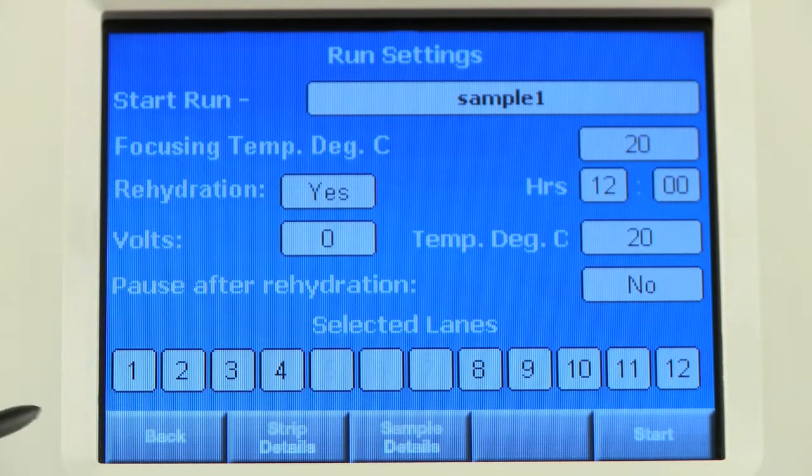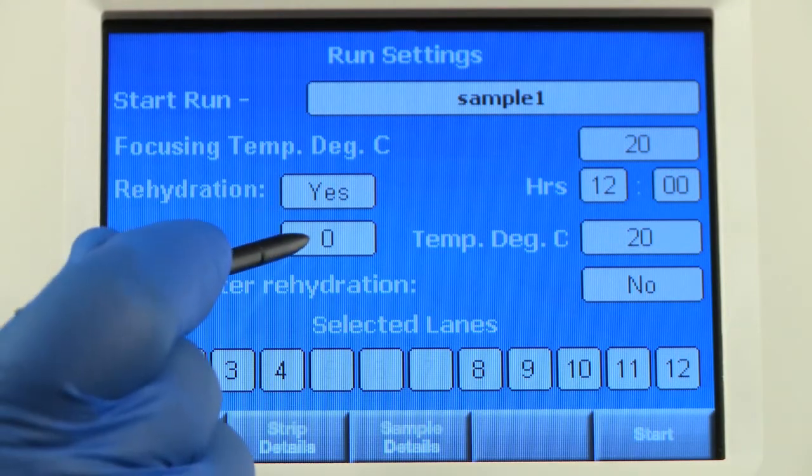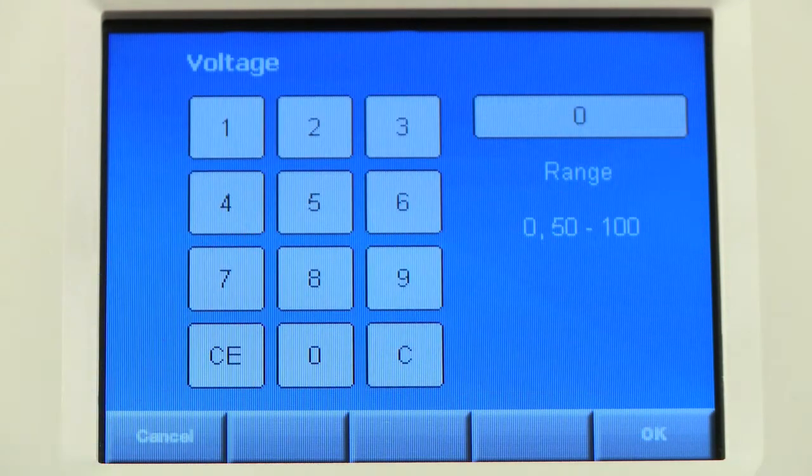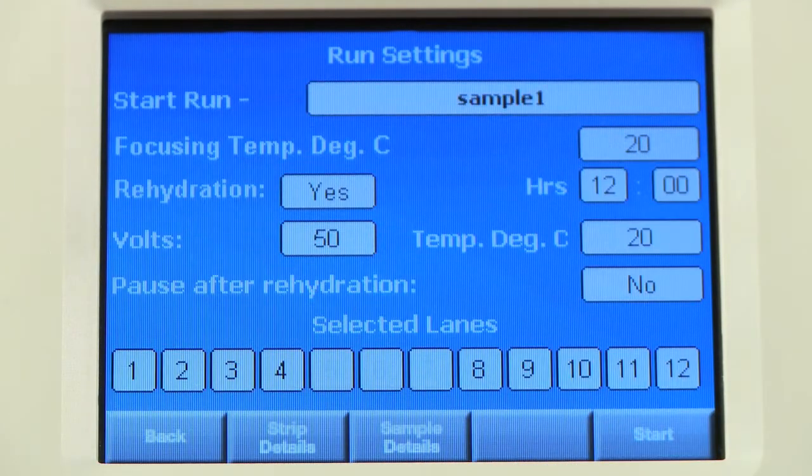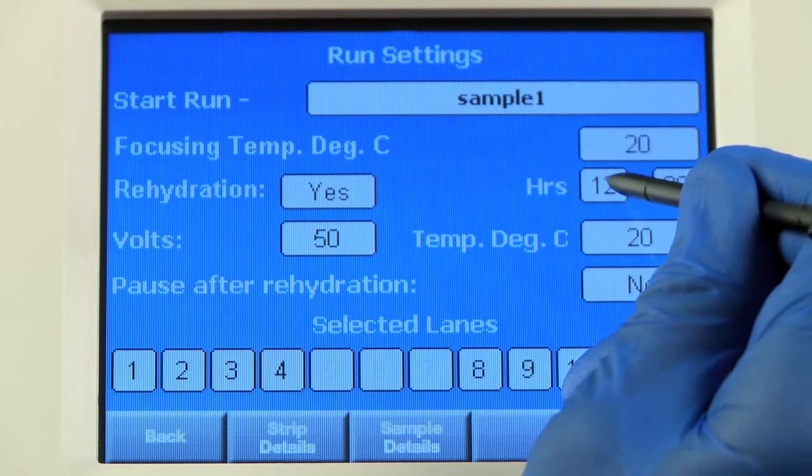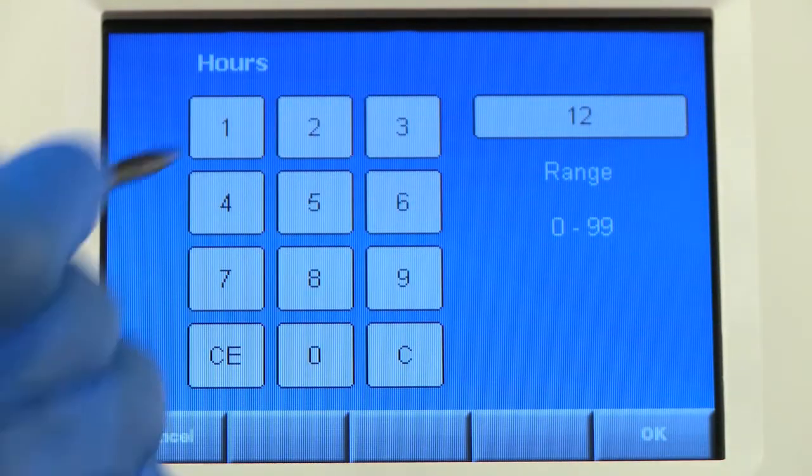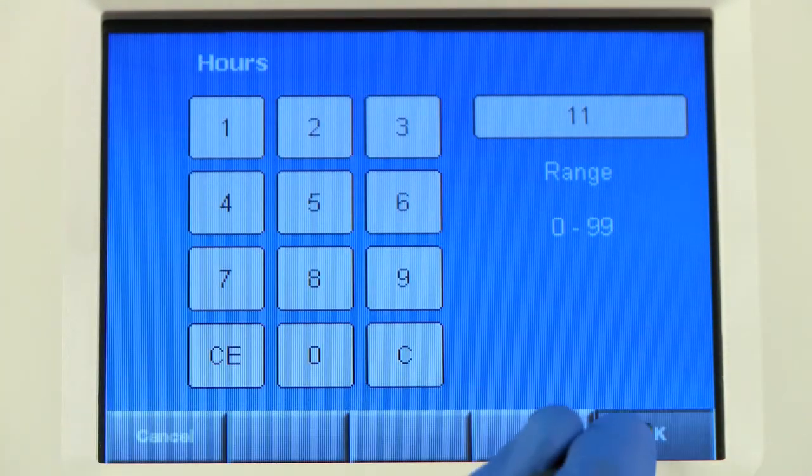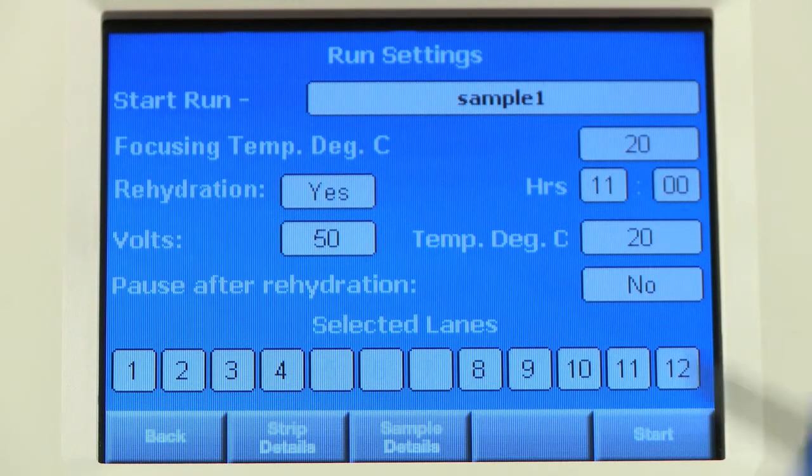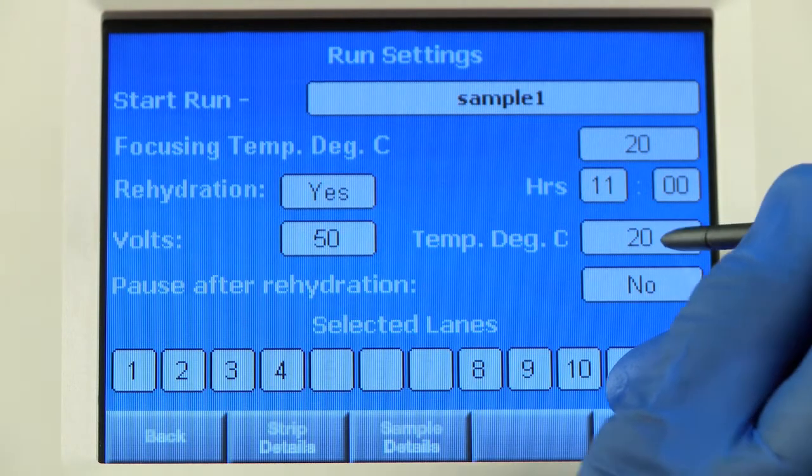Decide if you would like to program a passive, 0 volt, or active, 50 to 100 volt, rehydration step. And set the time for rehydration and the rehydration temperature.